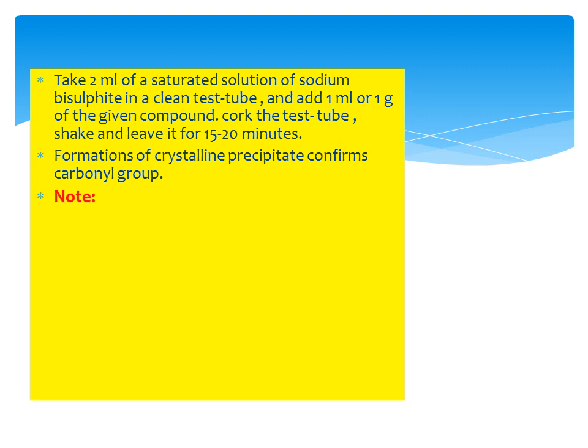One point which is very important over here is that these two tests, the 2,4-dinitrophenyl hydrazine test and the sodium bisulfite test, are specifically used for the identification of carbonyl groups. We do not use them to distinguish between aldehydes and ketones, because formaldehyde, acetaldehyde, benzaldehyde, and even some smaller ketones, like dimethyl ketone, methyl ethyl ketone, and even diethyl ketone, give this test positive.